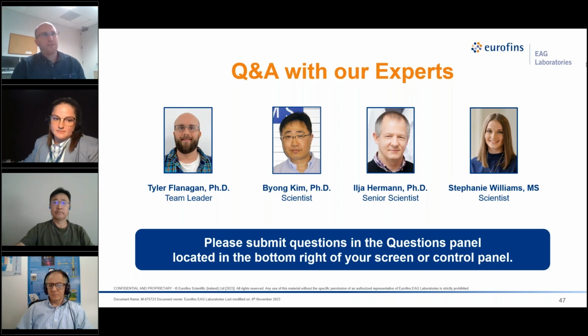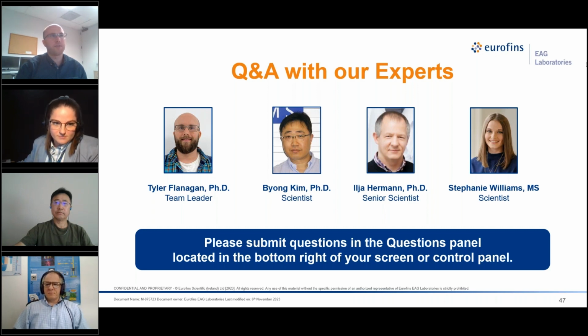So, your total range, right? With an optical profilometer, you're limited to 10 millimeters. If the opening is narrower, you might not be able to get data from the bottom, but it really depends on the sample geometries. In terms of accuracy, the machine internally calibrates, but we do SBC tests every week, get yearly calibrations, and the plus or minus is about 3%.